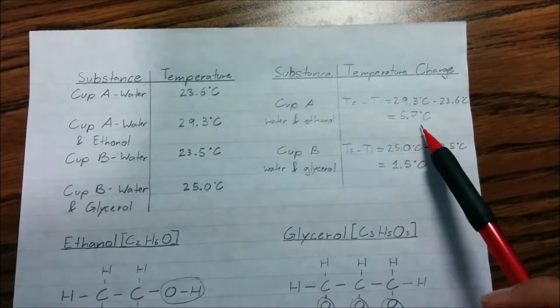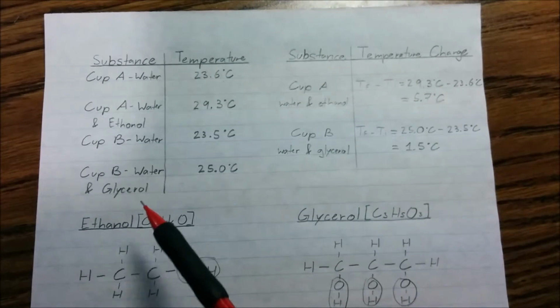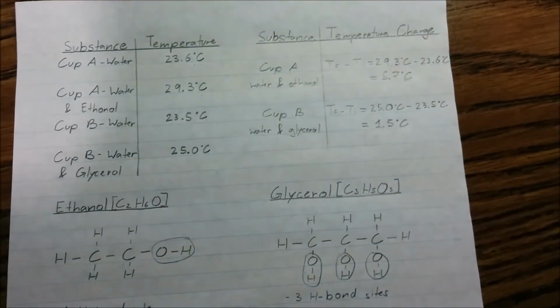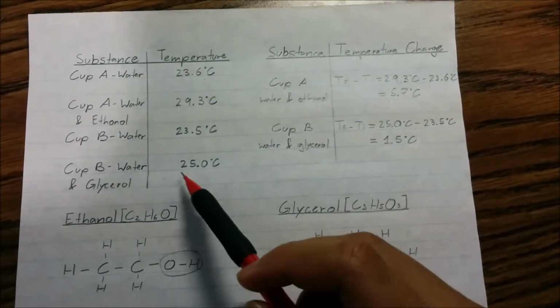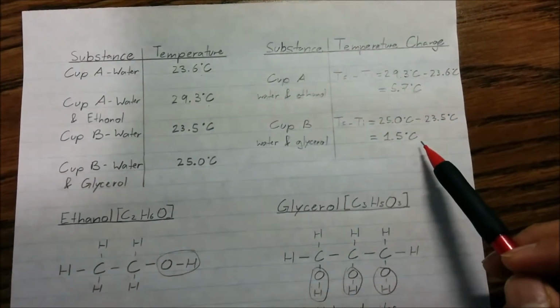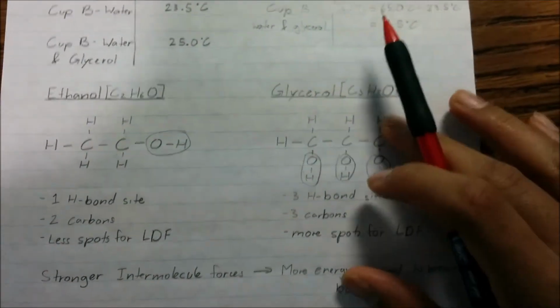of 5.7 degrees Celsius. Cup B, on the other hand, was for water and glycerol, which had water start off at an initial of 23.5 degrees Celsius. And after mixing that water with the glycerol, the final temperature plateaued at 25 degrees Celsius, creating a temperature change of 1.5 degrees Celsius. To find out why this occurred, the structure of both ethanol and glycerol must be observed.